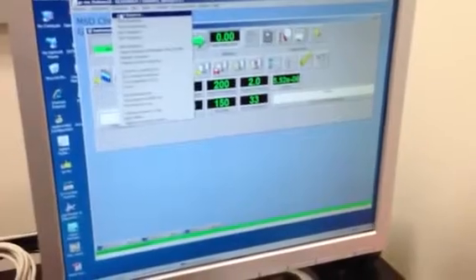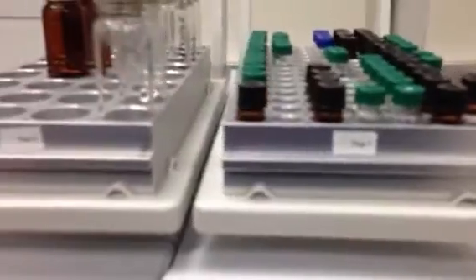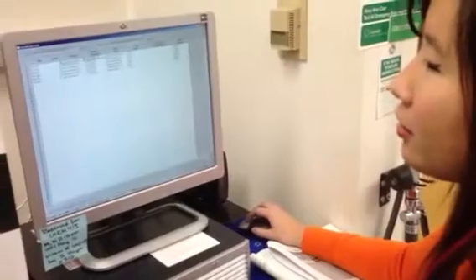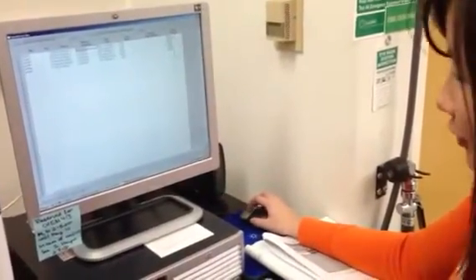The next thing you want to do is to edit your sequence, which means labeling which numbers your samples are in according to the number of the tray they're in. You go to Sequence and you can either load a previous sequence or edit your sequence. On the sequence screen, make sure all of these say sample or else they're not going to be run. These are the vial numbers — the numbers are up on the tray, and usually it will be in tray two. Under each sample you can change the sample name, make sure the method is the same for all of them, and set the quant report to default. Then click OK.